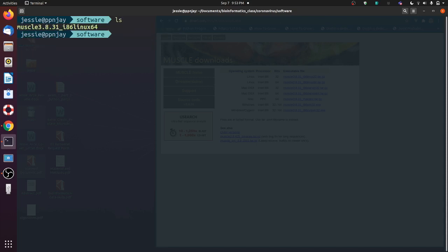And then I'm going to move muscle here to just muscle. I did just rename it. It's just the binaries, so here it is.